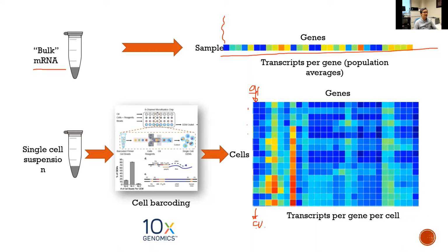Genes with high variability are important, something like this gene I, because these genes are highly expressed in some of the cells but not the others. It's highly expressed in those cells and lowly expressed in those. So this gene is biologically valuable to help you identify the different cell types. Based on this marker gene, those are one group of cells, and the rest of them are another group of cells.